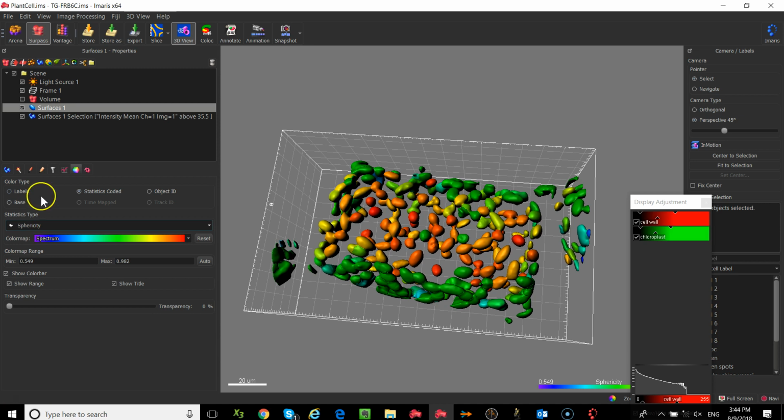Okay, so we've now covered the different thresholding techniques for surfaces. The next thing that I want to go through with you is some animations. And then after we do animations, we're going to jump right into tracking. Okay? Does anyone have any questions on what we've covered so far?